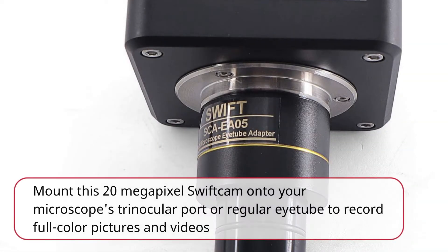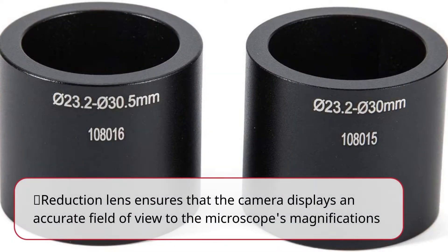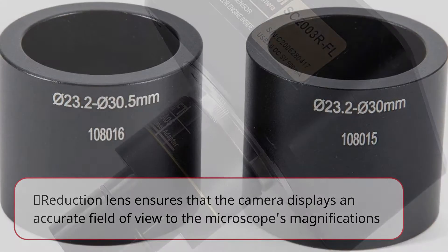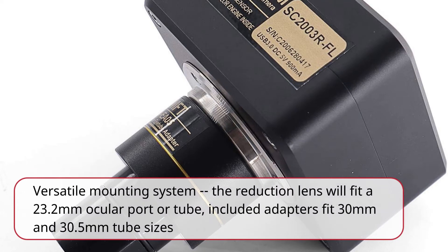Mount this 20-megapixel SwiftCam onto your microscope's trinocular port or regular eyetube to record full-color pictures and videos. The reduction lens ensures the camera displays an accurate field of view matching the microscope's magnification. The reduction lens fits a 23.2mm ocular port or tube, and included adapters fit 30mm and 30.5mm tube sizes.